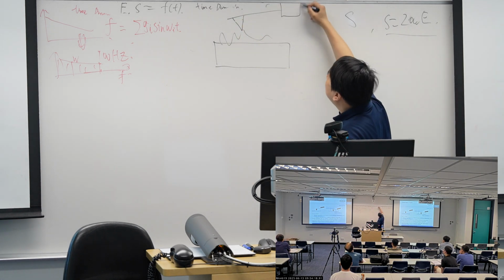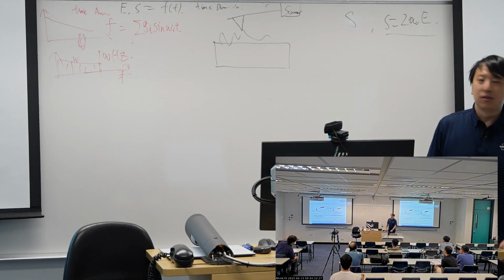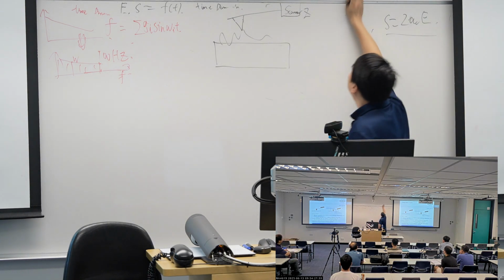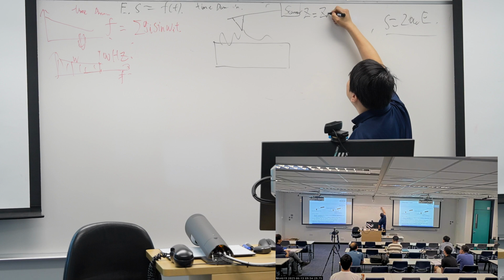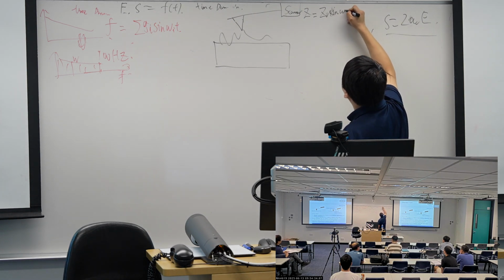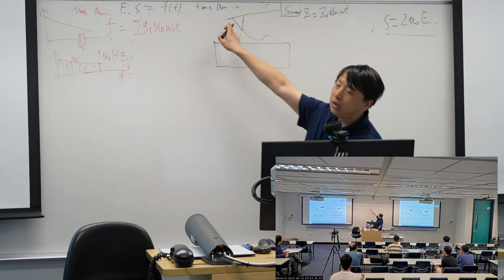We can directly control its scanner. So we make our Z movement periodical. And as such, we observe the vertical change.